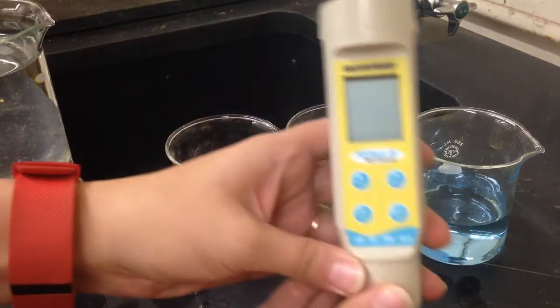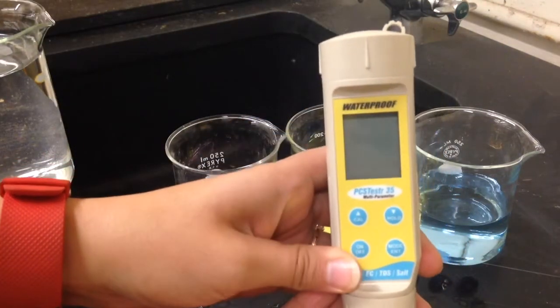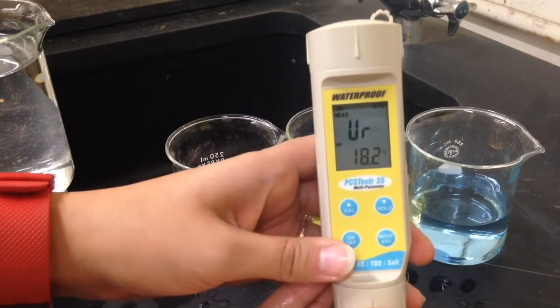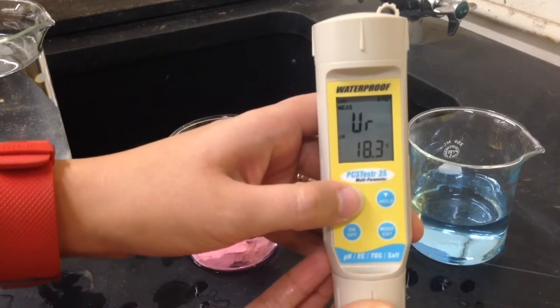To calibrate your meter, you need to turn it on and ensure that it is in pH mode. To start the calibration, we are going to push the calibration button.